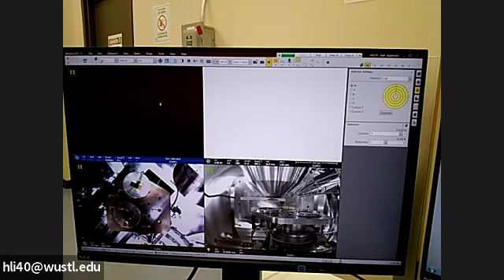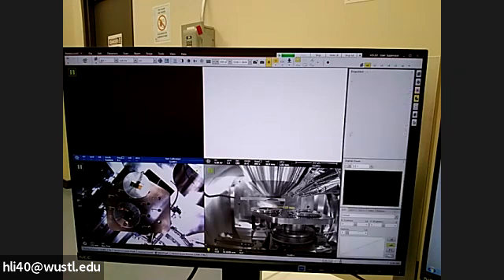The left quarter detector we normally set up to be the ETD detector for high vacuum mode. If we go to low vacuum mode, we will set it up to be the low vacuum detector. So pay a little attention to the detector at the start of your scanning to make sure it's the detector you want. The next thing is basically just a mini Photoshop here. You will play with it and you will know.